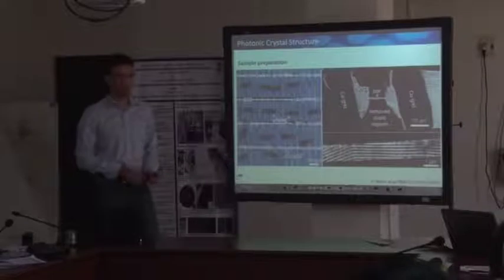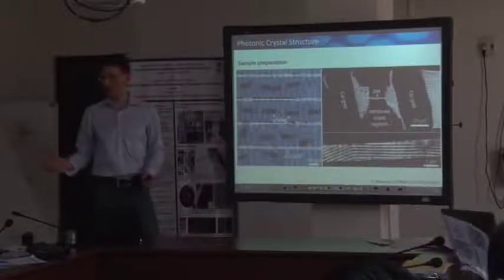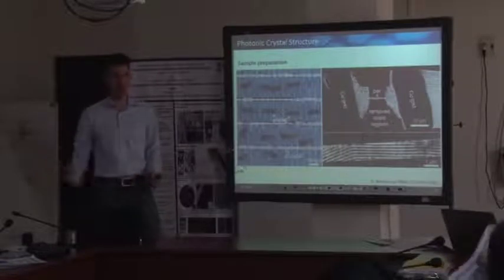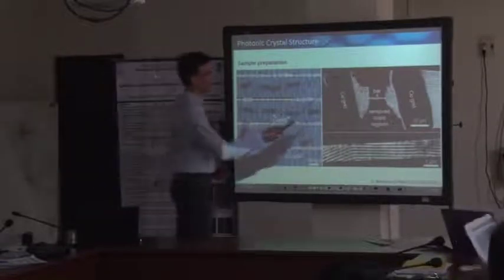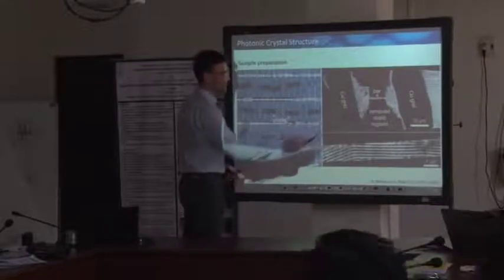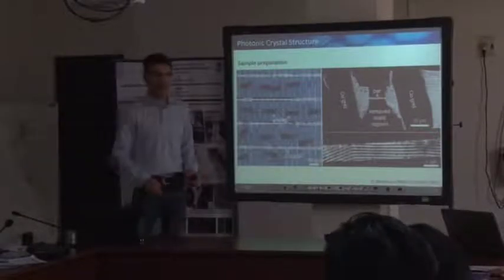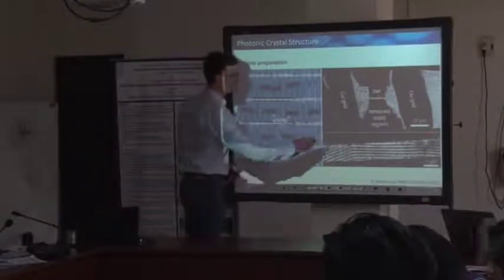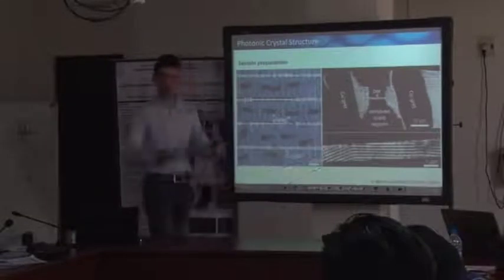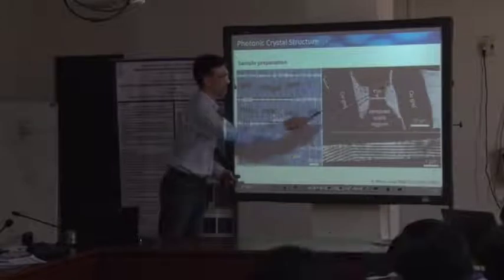And you can easily imagine that wherever the ion beam hits the sample, it gets immediately destroyed. Okay? Totally destroyed. And this is how our technician removed the material without exposing the central area to the gallium ion beam at all. You can do that blind, just by watching one or two times using the electron beam, then adapting the scan fields for the ion beam.